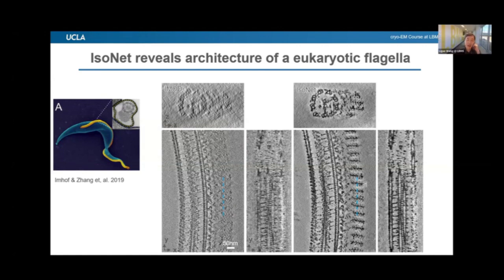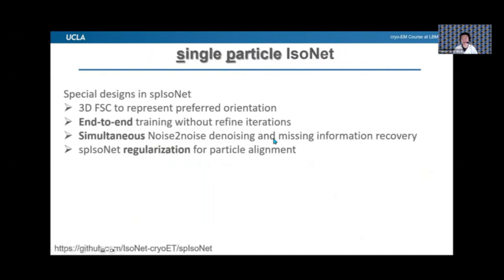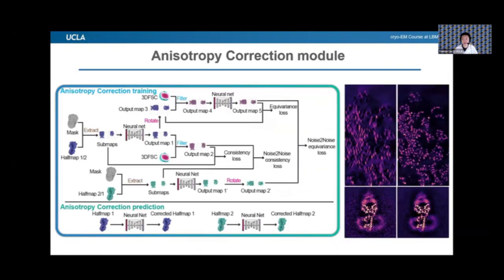Okay, thank you. The other question is, you showed how much information we can miss, the 30 degree, 15 degree, 45 degree loss. I'm wondering, in those investigations, whether all other information is completely removed or some of the information is still included. For that simulated test, because we can only do that in simulation, this is a complete removal of the information.